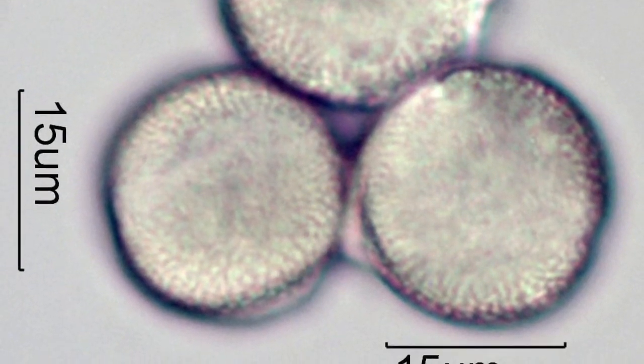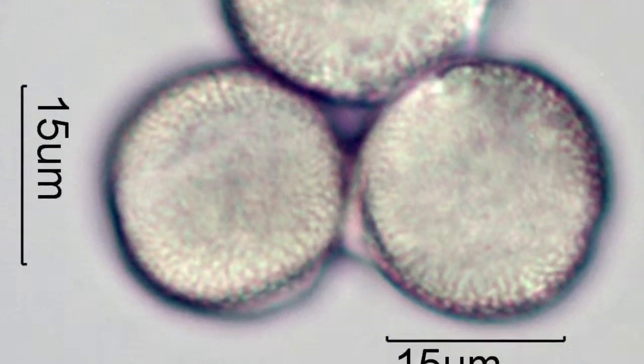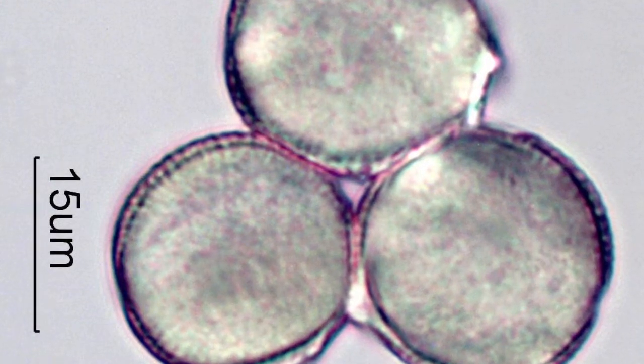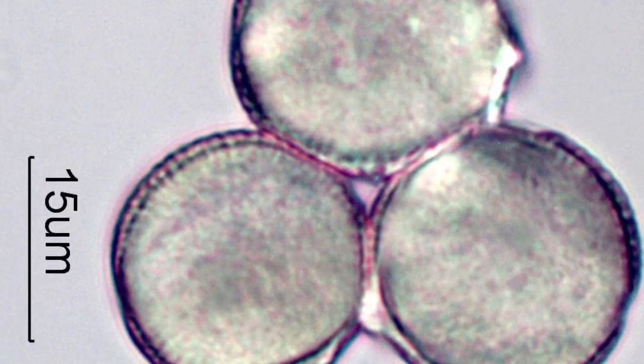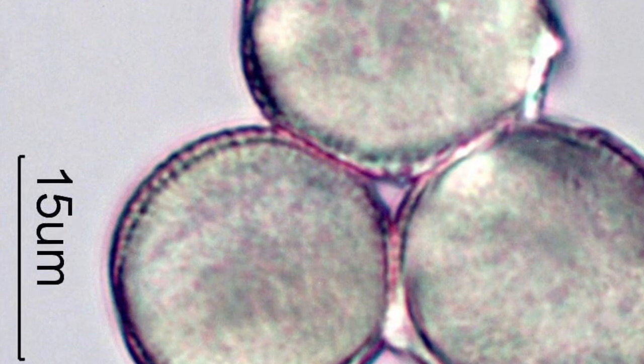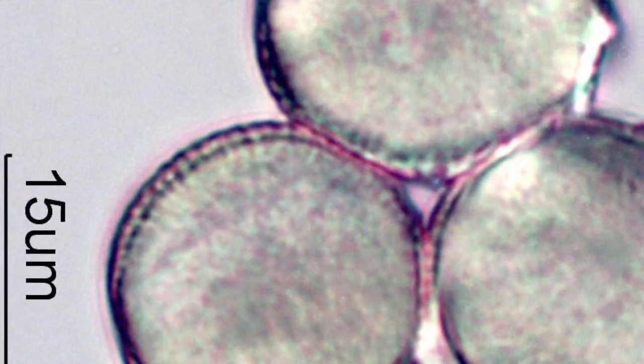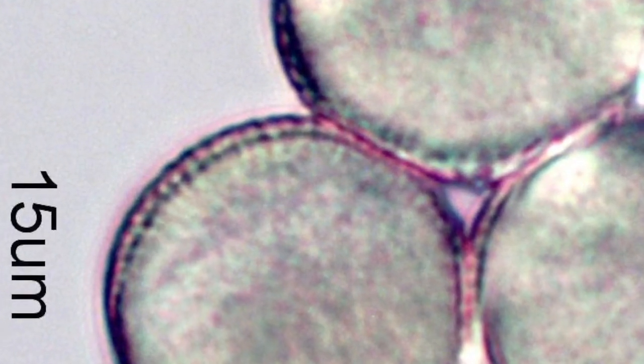Now what we want to do is focus down toward the cross-section of the pollen grain. You can see here that we can actually see the little columns that hold up that net-like structure, that those little columns are baculate. And again, another characteristic of this pollen grain.